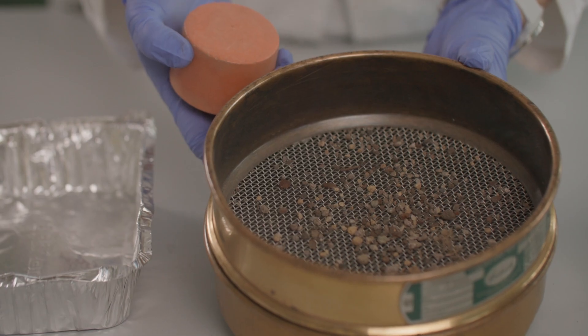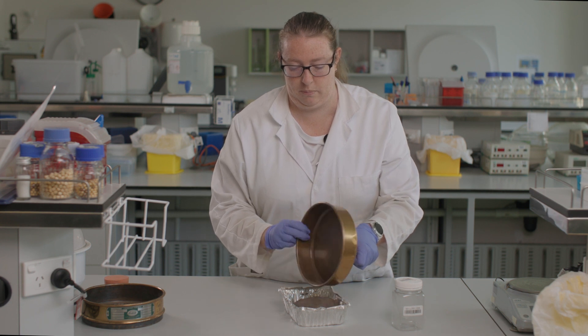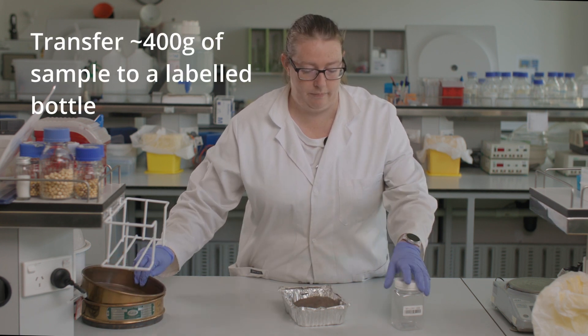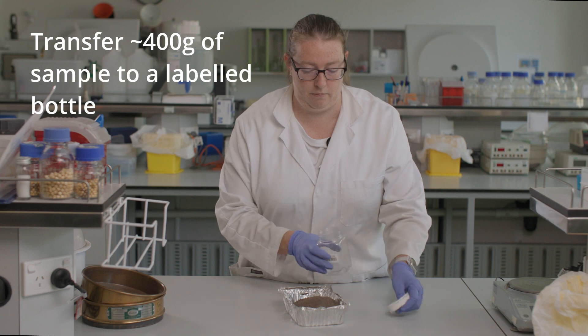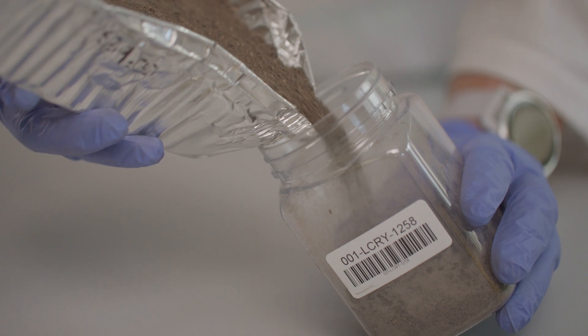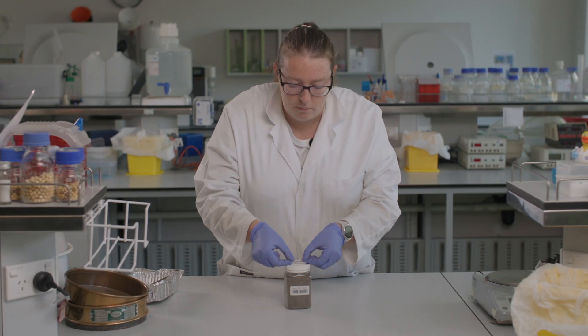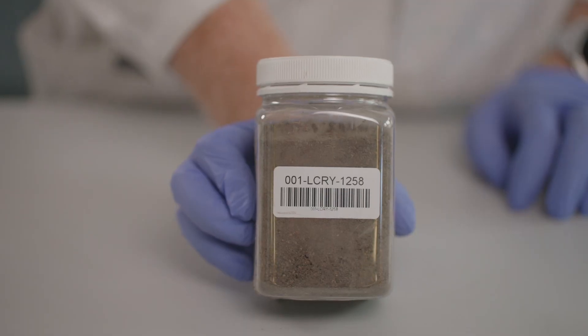Discard the coarse soil fraction and pour the less than 2mm soil fraction back into the tray. Transfer the entire sample or a representative subsample into a plastic sample bottle labelled with the unique sample label. Securely fasten the lid on the sample bottle and label the lid with a duplicate sample label.